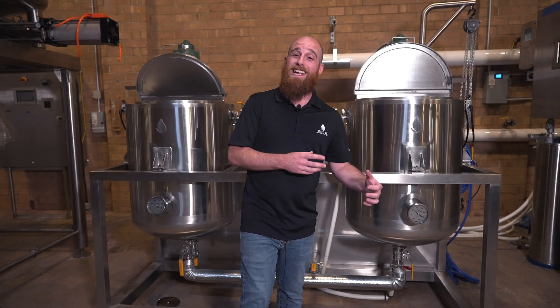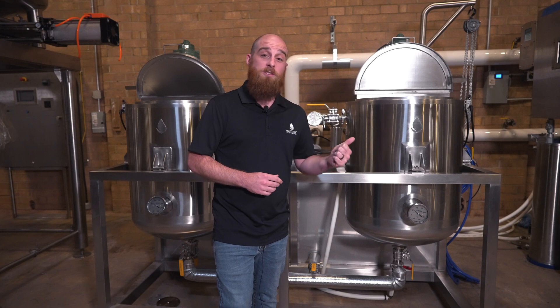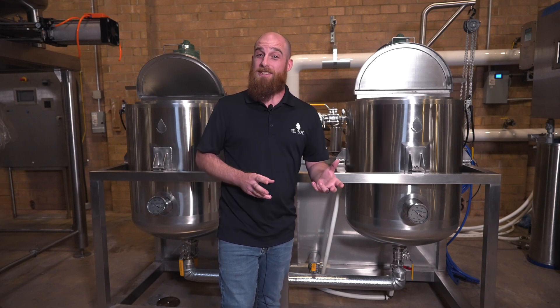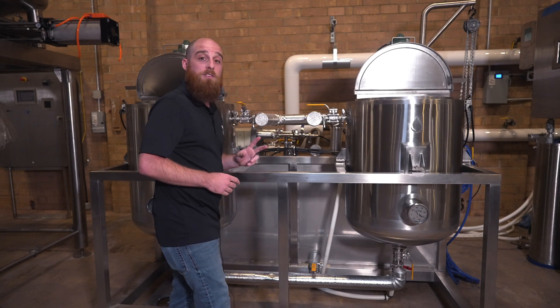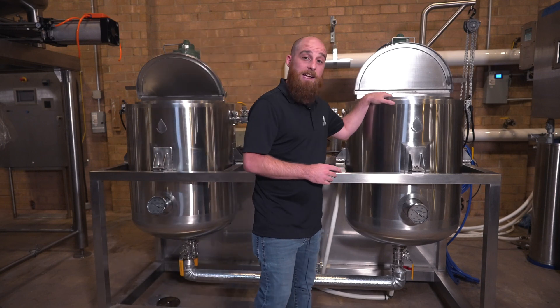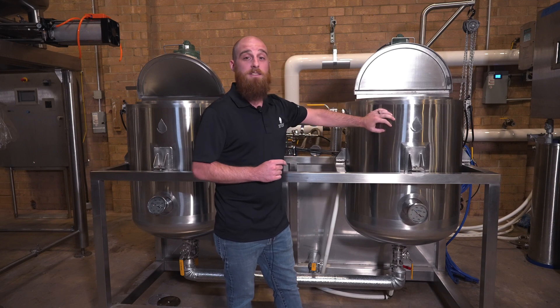So, how does it work? Generally speaking, what you're going to have to do is create an environment anywhere between negative 40 and negative 80°C for the winterization process to happen. Additionally, we'll also be adding a polar solvent such as ethanol to help the separation process. What you see behind me are two 70-liter jacketed tanks that are going to be able to introduce super chilled glycol into these tanks to create that negative 40 to negative 80 environment.